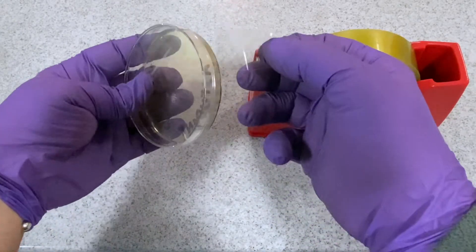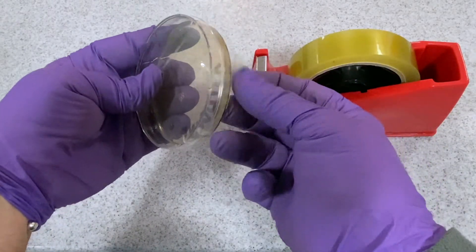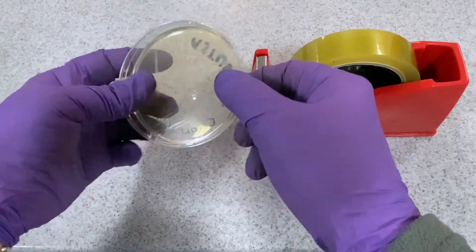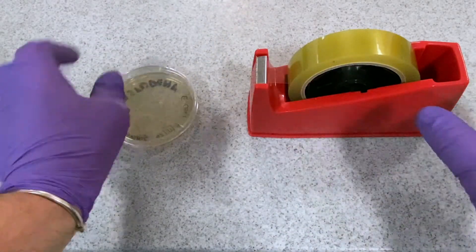The petri dish lid is secured by means of sellotape as previously described. Do not seal completely around the petri dish.